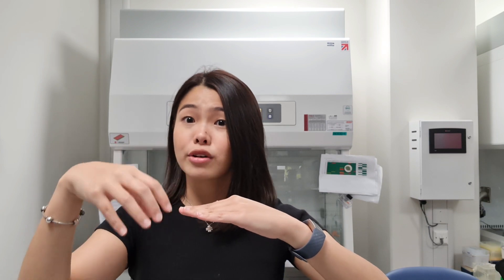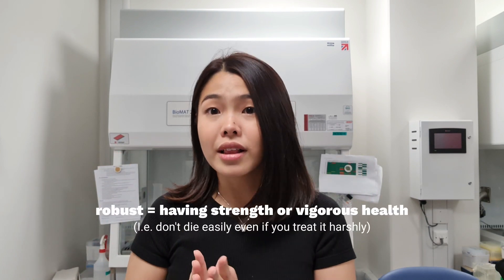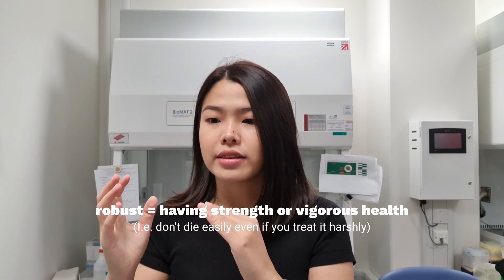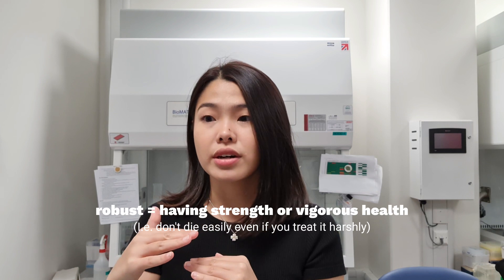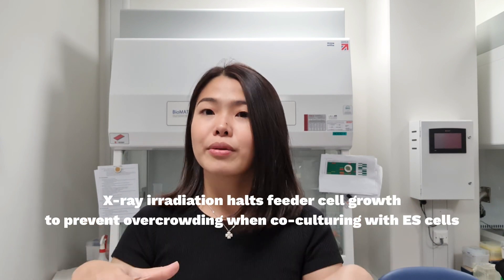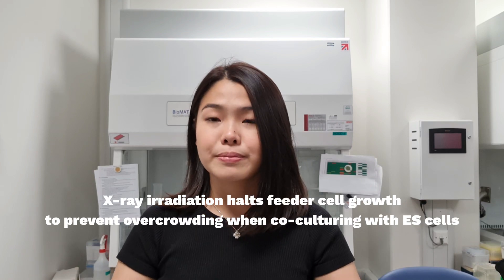ES cell colonies are growing on top of the feeders. These feeders are very robust cell lines and they grow extremely quickly. So before we actually plate the ES cells on top of these feeder cells, we irradiate them to stop them from constantly growing, being over-confluent, and taking over the ES cells. This irradiation makes sure that the amount we plate is the amount that remains.